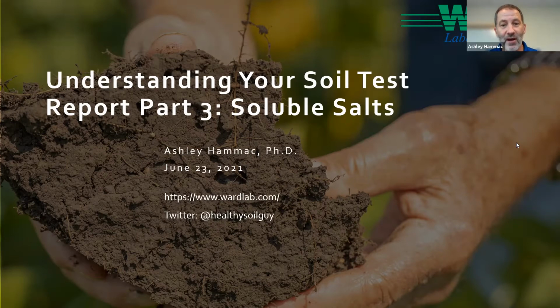This is the third part in a series of understanding your soil test report presentations. We're doing short presentations to go through each part of the Ward Lab soil test report. Today we'll be talking about soluble salts.